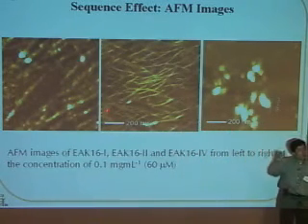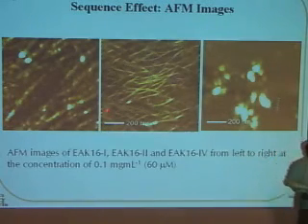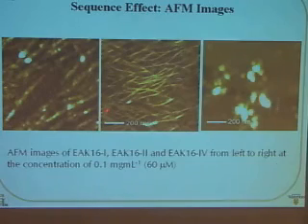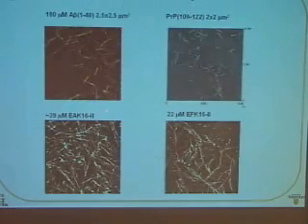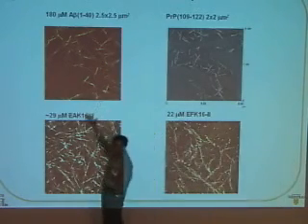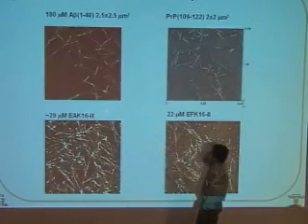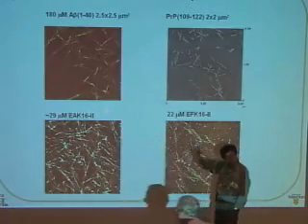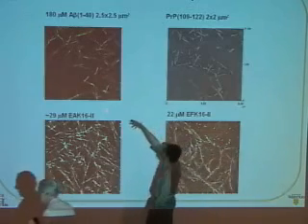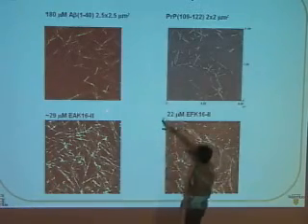Some of these nanostructures will cause disease, and some will be degraded without causing you any problems. The next picture shows a comparison. This is the protein you can find in Alzheimer's disease, the amyloid beta peptide. If you put it into the right environment, it forms these nanoscaled structures.